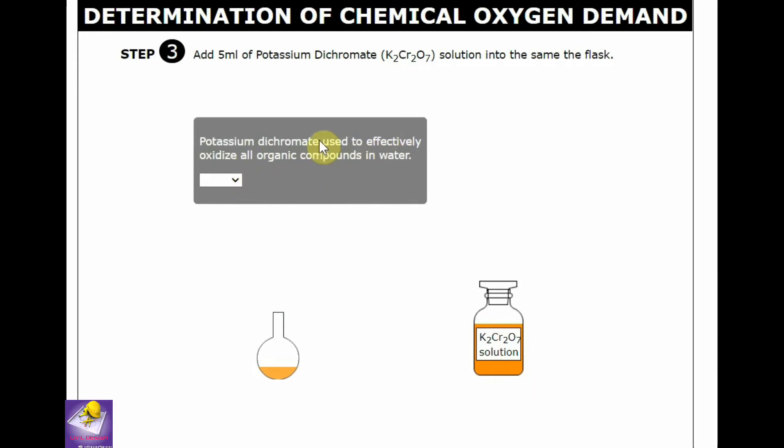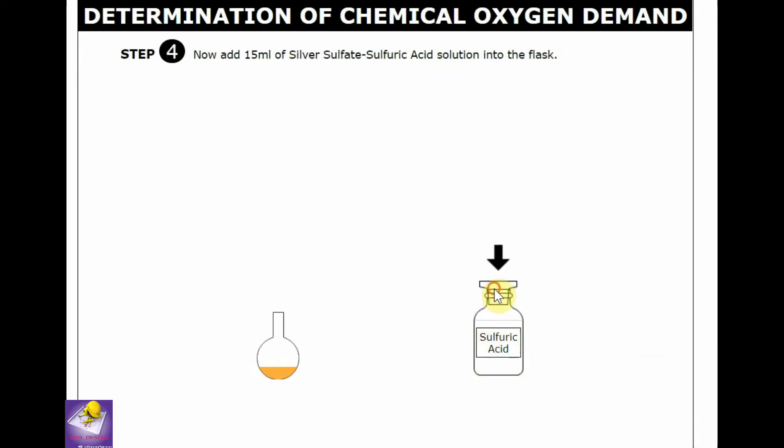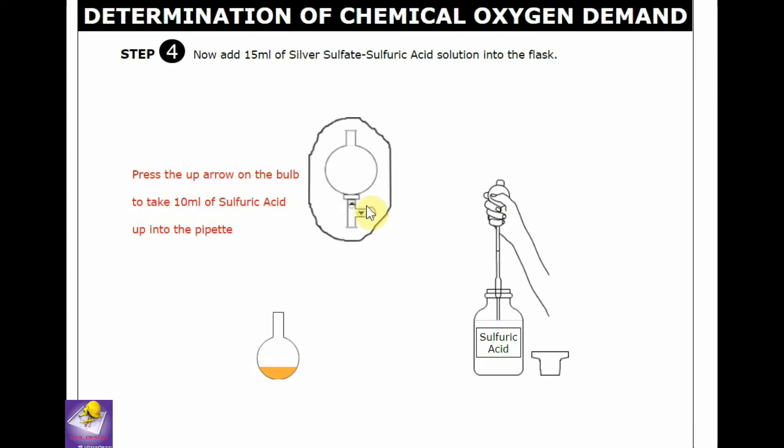Potassium dichromate is used to effectively oxidize all organic compounds in water. That's why we use potassium dichromate to that solution. Now add diluted sulfuric acid of 15 ml to that flask by the graduated pipette.